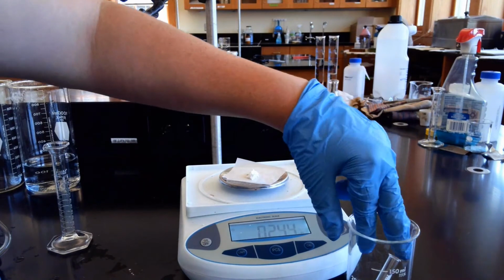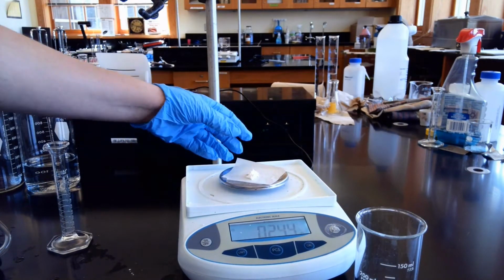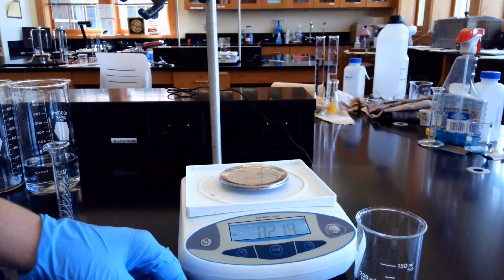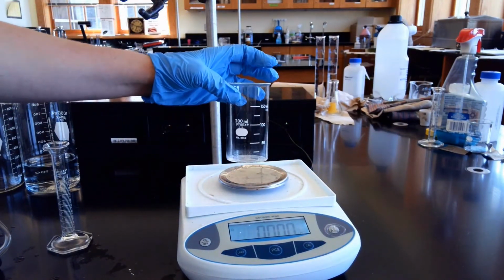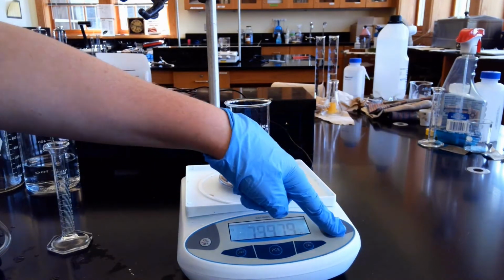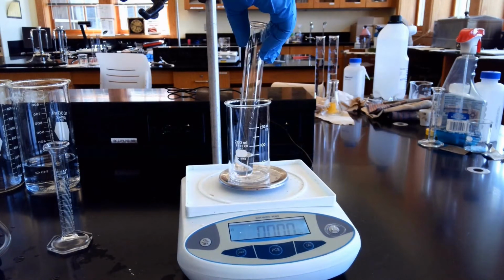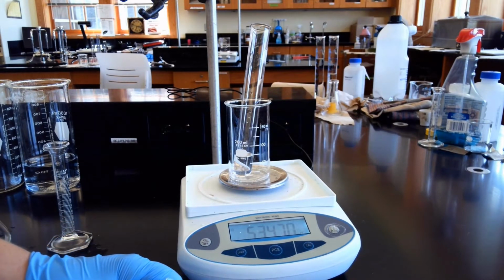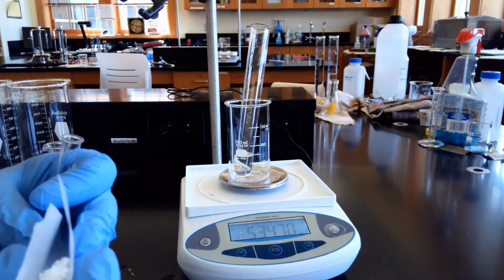Now we're going to take our small test tube and fill it with our CaCO3. We're just going to move this off for a second. I'm going to tare the scale first. We'll put our beaker on. We'll tare our beaker. Here is our 3 molar HCl. Now the tough part, getting the CaCO3 actually inside the test tube like we did last time.